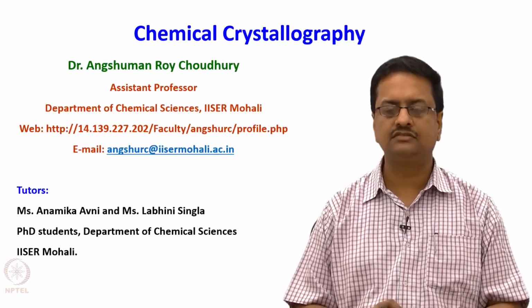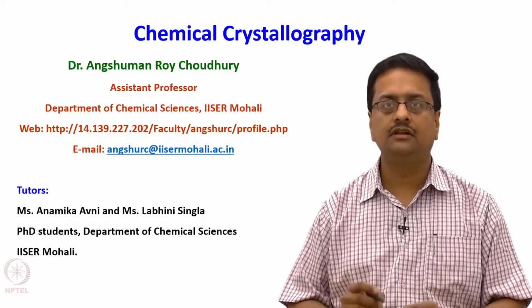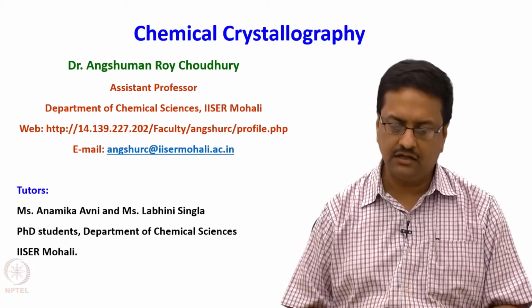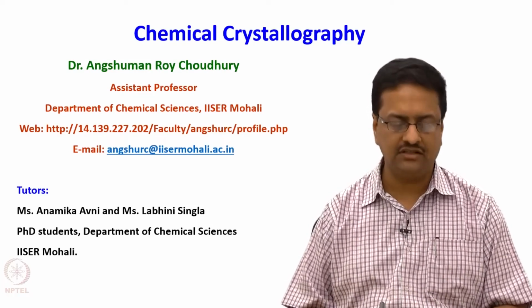Welcome back to this course of chemical crystallography. We have learnt about the data collection and data reduction methodologies in the previous couple of lectures, and today we will start trying to understand how one can solve structures using different methods.